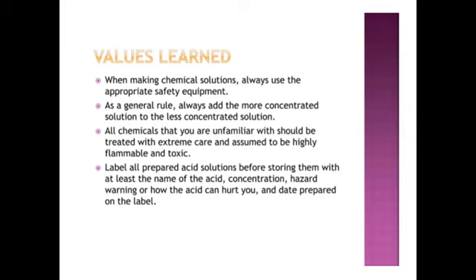And finally, in your information, also add the date that you prepared it, because over a long period of time, maybe the acid is not being used, and it has reached some time where it may not be needed again. So they need to know the date so that they know if it's still valid, if it's still necessary to be used or not. Some will require that they prepare them freshly. So if the date is there, they can decide. So these are few pieces of information that ensue from preparing standard solutions.